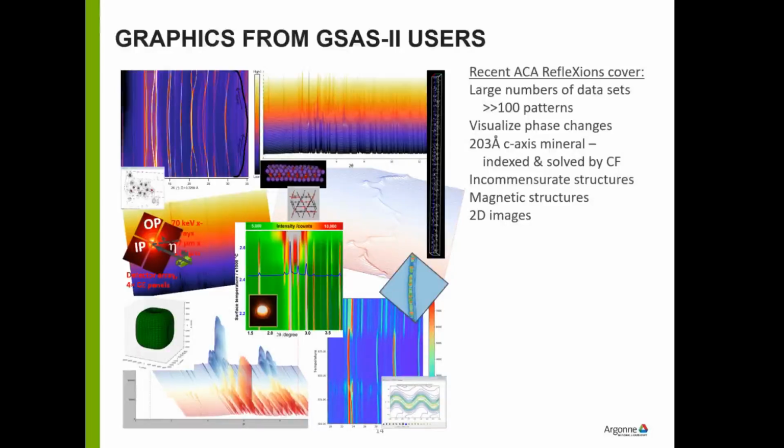Turns out someone has already done the crystal structure, a single crystal structure of it in the rhombohedral space group R3 bar C, centrosymmetric. And it has got disorder in it. And when I looked at it from high resolution powder diffraction data from 11-BM, absolutely spectacular pattern because it's very sharp. And the lowest peak, which is the 006, no less, is down behind the beam stop. Okay, so I only see a bit of it, part of it.